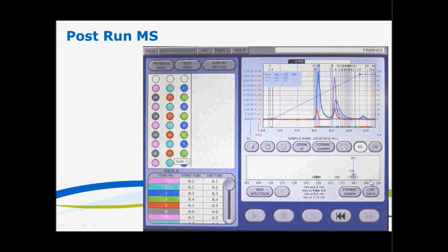You might ask, what if I don't see the information here that I'm looking for? Well, you can simply format this graph, and you can change the settings on this. This happens to be 100 to 200. I can change this up to 50 to 1200, because even though the data is displayed here, the entire spectral information is stored from 50 to 1200 Dalton.